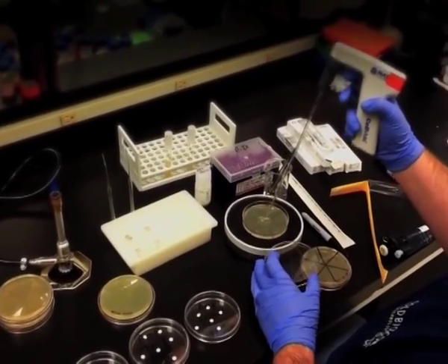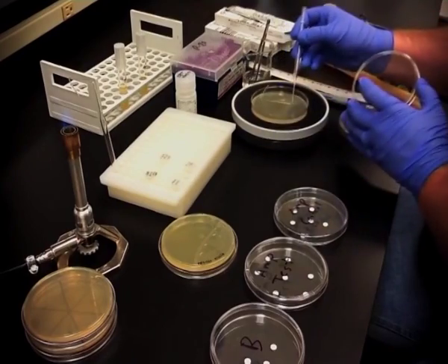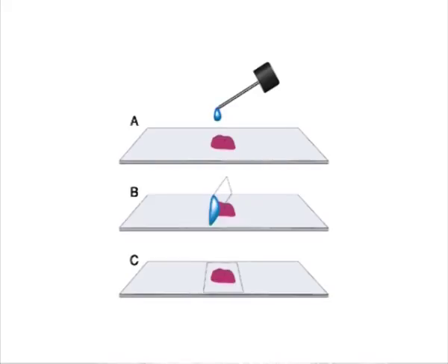Let us learn about wet mount method. Wet mount is a method for observing microbial samples under a microscope. Here, a desired liquid sample is placed on the slide as shown in figure 2. Thereafter, a cover slip is placed without forming any air bubbles. The fluid spreads out in a thin layer between the cover slip and the slide.